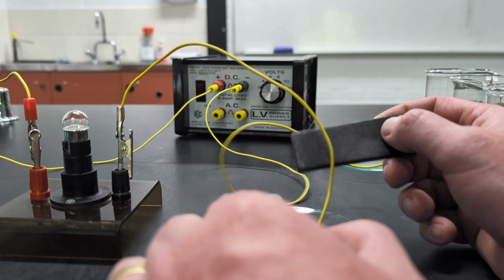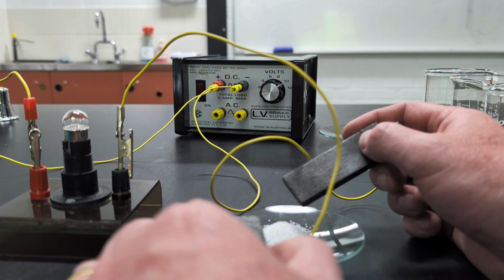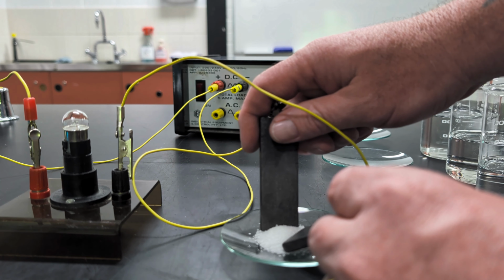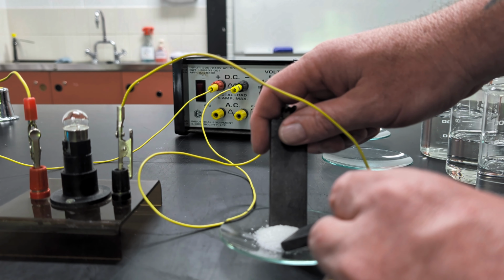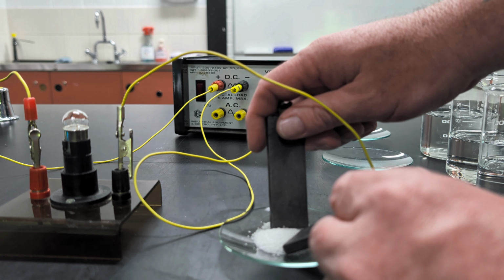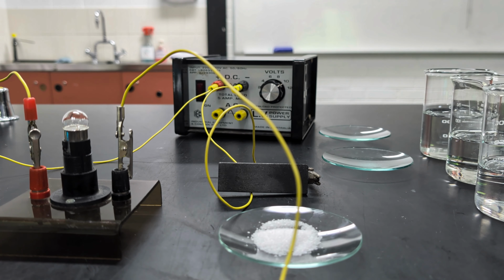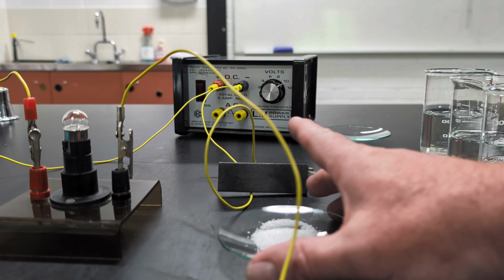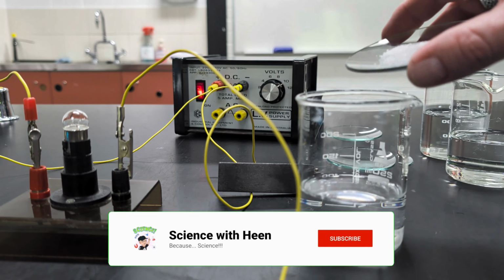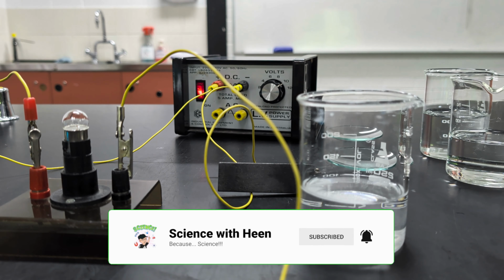So when we touch these electrodes, remember, yep, the lamp is glowing, completing the circuit. When we touch the electrodes to the salt, we find that the lamp doesn't glow, because whilst we have charges there in the ionic lattice, they can't flow. There is one easy way to dissociate that ionic lattice into the constituent ions, and that is to put it in water. So I have some deionized water here.